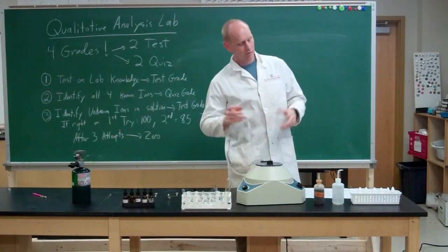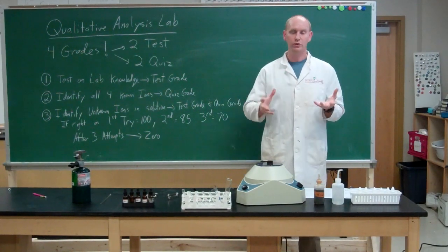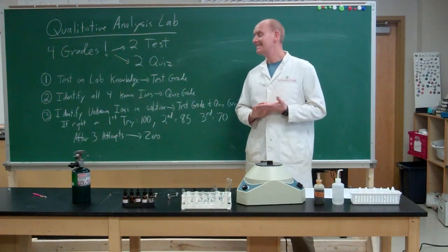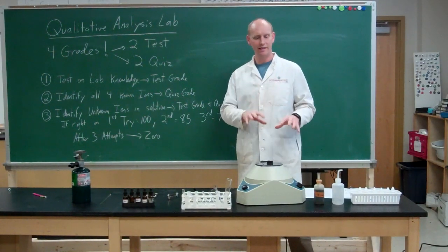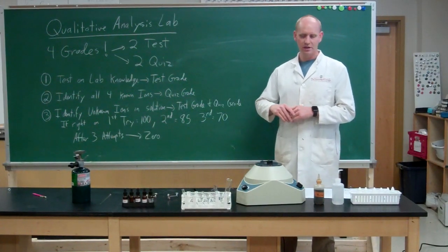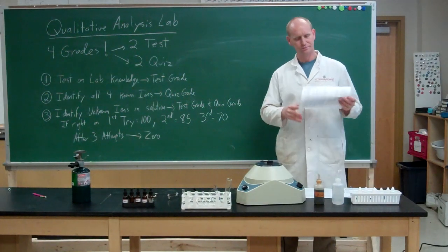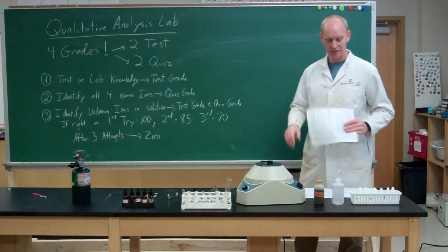After this video, and after you've read these papers, you're going to know a fair amount about what you're doing in this lab. Before you start the lab, you have to take a test on all the lab knowledge. It's going to cover what you do in the lab, how you use the equipment, what chemicals you use at certain times, and safety questions, as well as just general knowledge on how the lab is graded and completed.